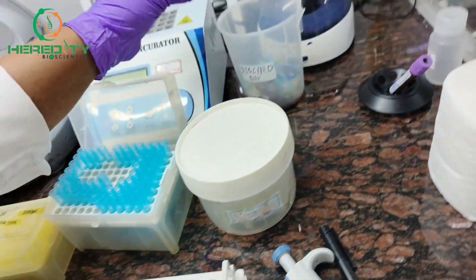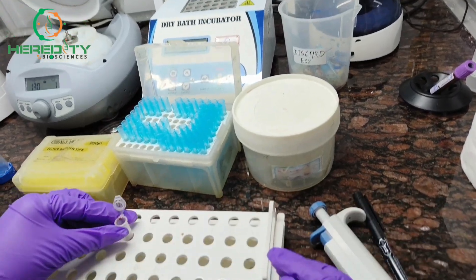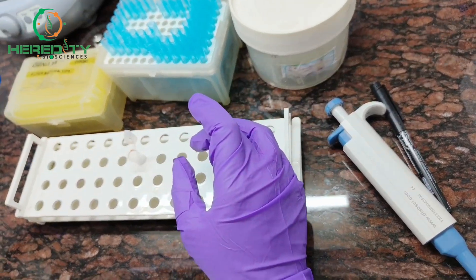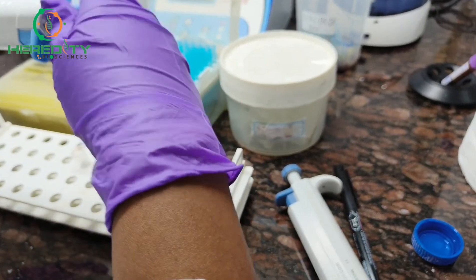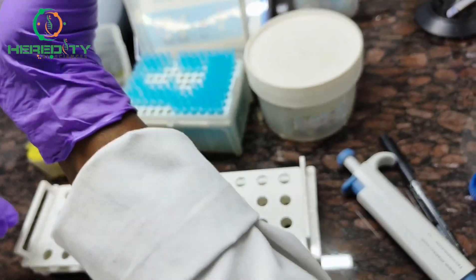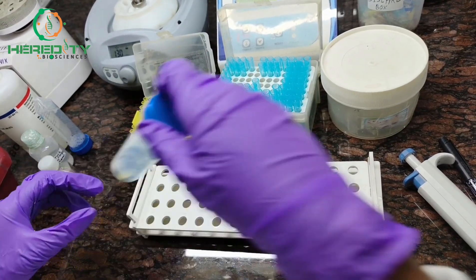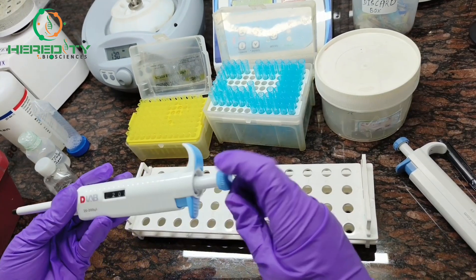After centrifuge, discard the supernatant. Now we will add 0.2 ml of sodium acetate and 20 µl of 10% SDS to this pellet. Add 200 µl of sodium acetate, then add 20 µl of 10% SDS.